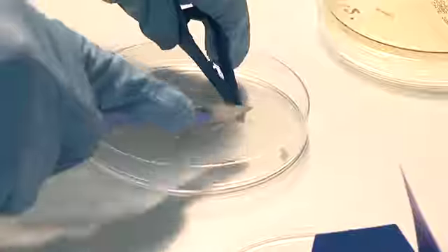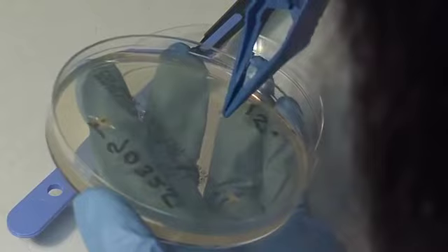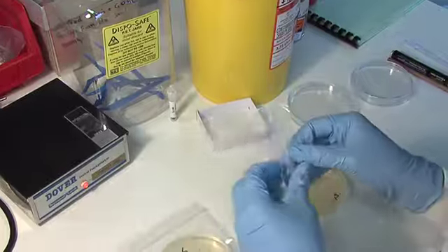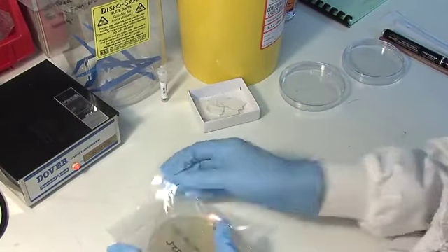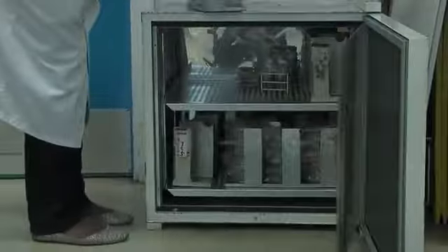Samples are cut into small fragments and are inoculated using sterile forceps just below the surface of the media, placing at least 3 inocula onto each plate. The plates are then placed into plastic mini-grip bags to contain any fungal growth and any fungal spores that may be generated in order to prevent contamination of other plates. Plates are incubated at 28 degrees for at least 14 days with examination each week.